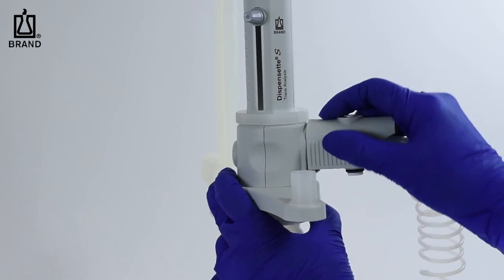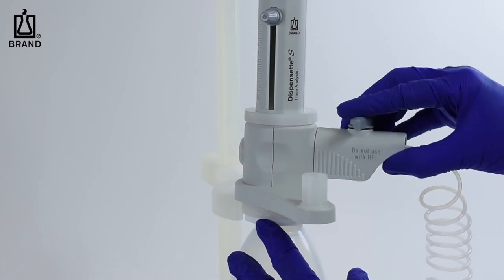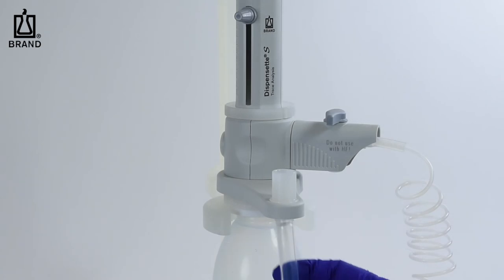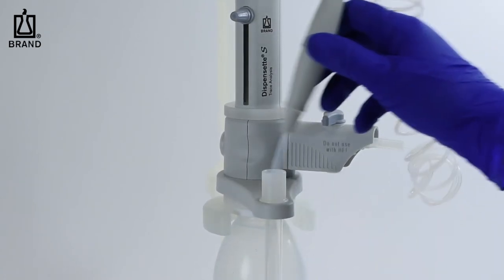Slide down the housing and snap into place. Select the correct color valve cap for the instrument you are using and install onto the valve mounting plug. Then take the holder tube and screw it into the flexible discharge tube holder.